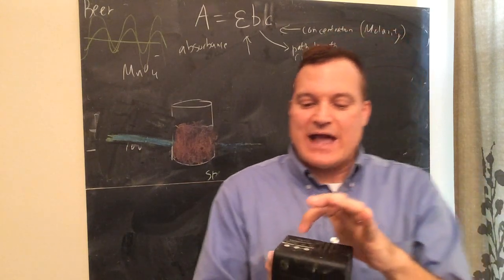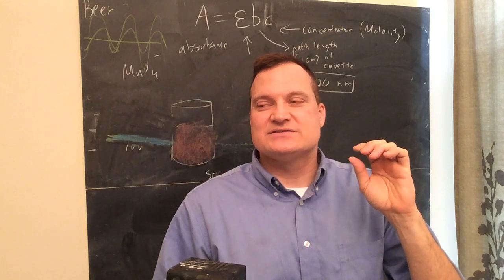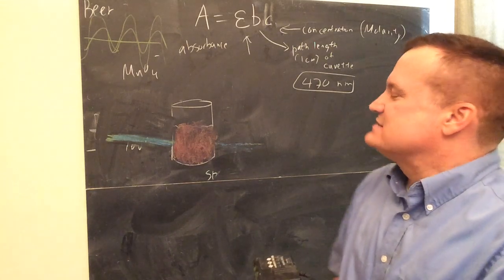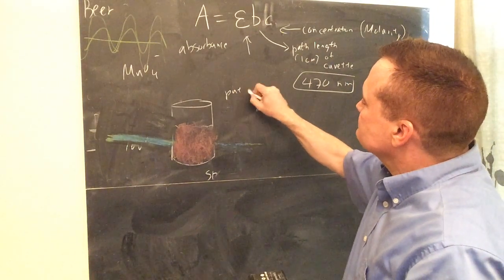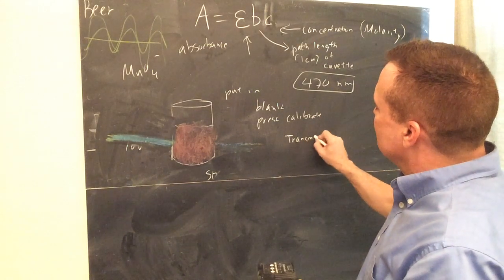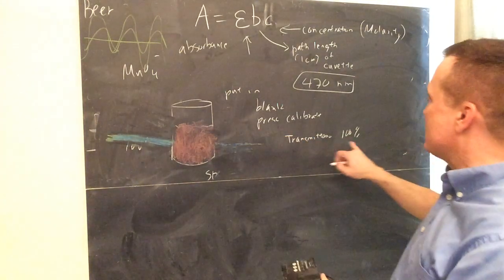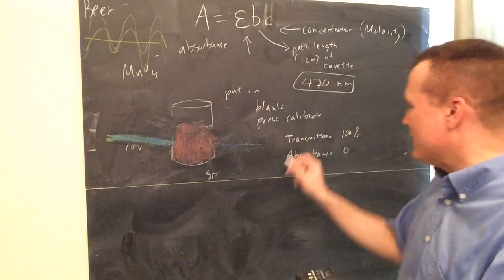To calibrate it, you push the cal button, calibration, and when you push that, it will say that you have a transmittance, or absorbance of 0. Yeah, it'll be a 0 absorbance. Or, I'm sorry, it'll be 100% transmittance. I'm so sorry. When you put in the blank, press calibrate or the 0 button, and you'll see that transmittance. This makes sense. When blue light shines through, transmittance should be 100%, because if you have pure water in there, all the light will pass through. So it'll be 100% transmittance, and your absorbance will be 0. Maybe I was saying it right, and then as I thought it through, drawing it, I corrected myself.